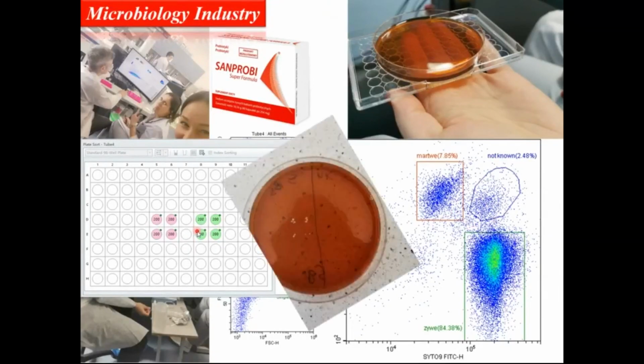After sorting, and after a few days of growth, you can see how the alive ones are alive. And in this media, these not culturable but countable cells are not growing. But the other thing that you can see is that nothing else is growing in this agar plate.